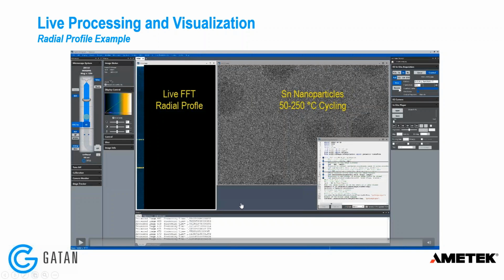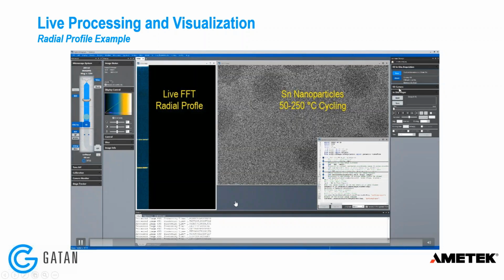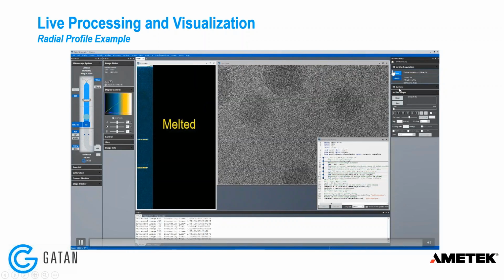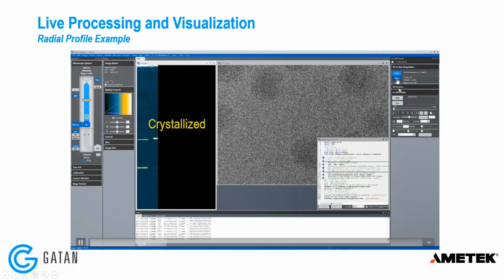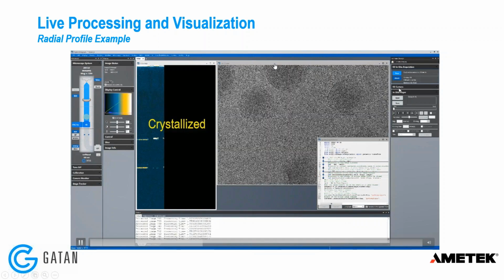I want to go on to this one, where this is actually an example of me running one of these Python scripts while acquiring the data. So I've just clicked the record button to start an in situ video recording using our K3IS camera.